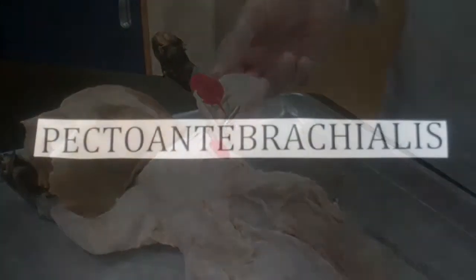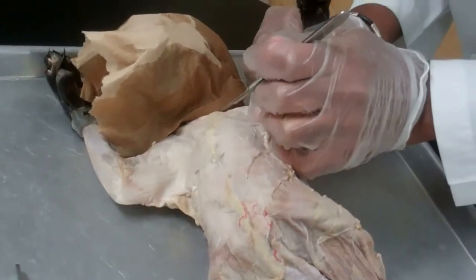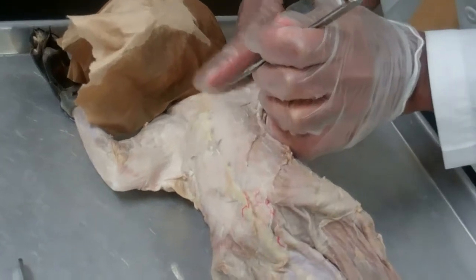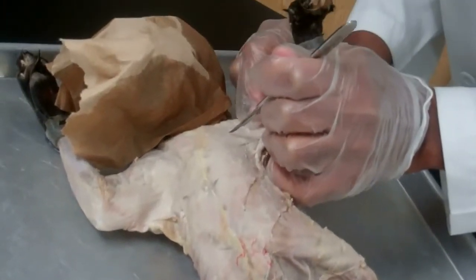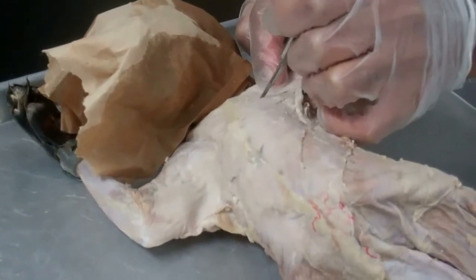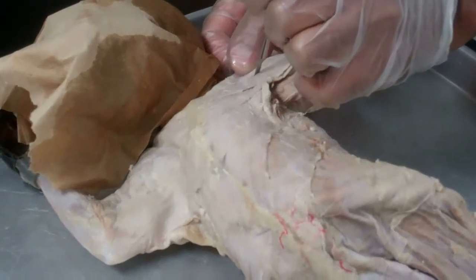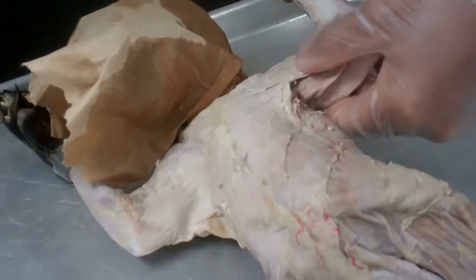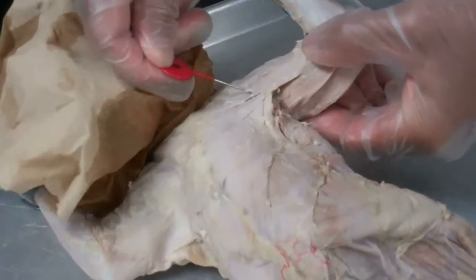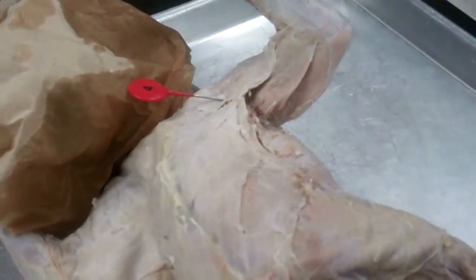Number three. Pecto antebrachialis. For the pecto antebrachialis, once you peel back enough of the fascia, you'll see a little white line separating the pecto antebrachialis. This muscle right here, number four, is pecto antebrachialis.